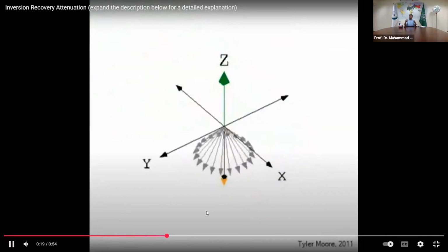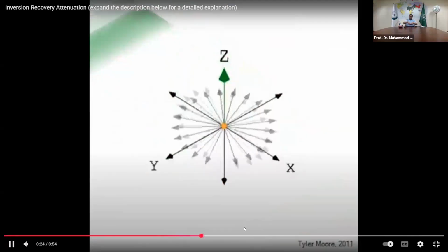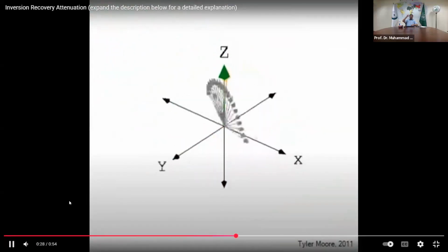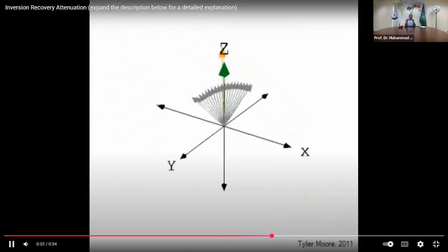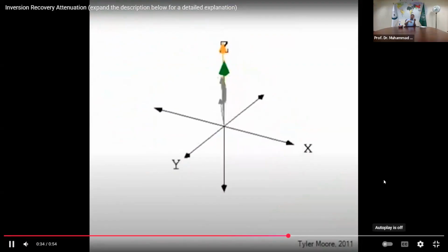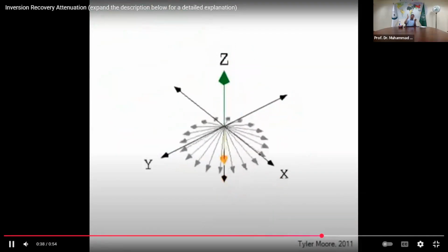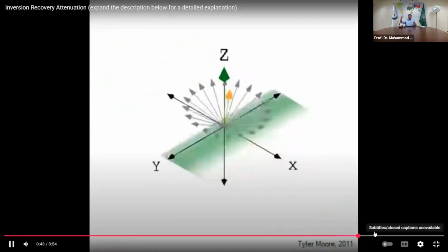Okay, so this is what is recorded, and you measure from full minus z to plus z by using the second pulse, and this second pulse brings it to the XY plane. So you see the umbrella is moving from full negative to full positive. As you saw in my slide, from full negative peaks to full positive. And remember, why full negative?